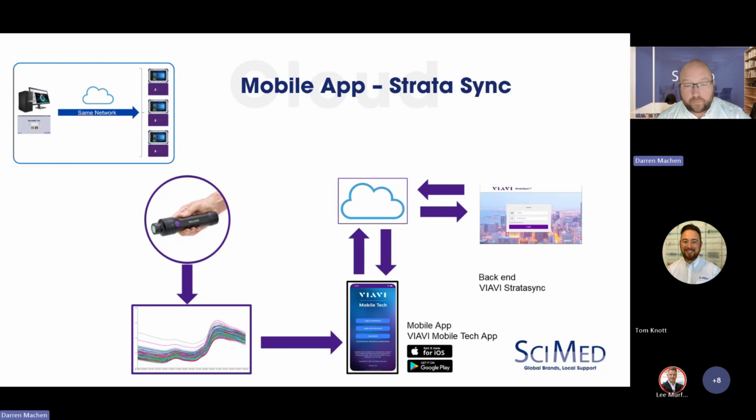And the big strive recently is actually being able to do this when the cloud is not available. You have a very powerful phone in your pocket. The calibration is also stored locally on there, so if the internet is not available, you can still predict, where previously that was something that we had to improve on.